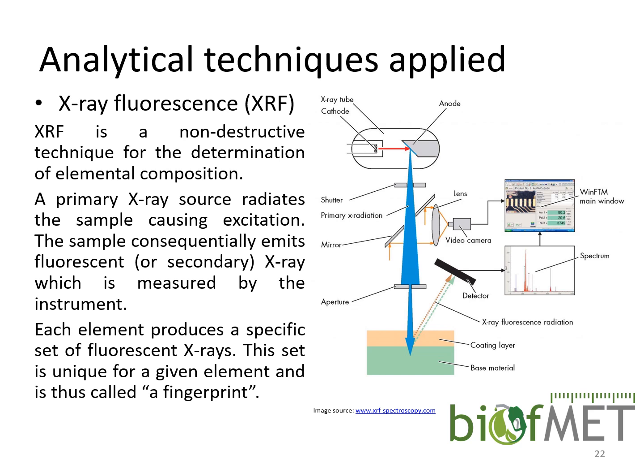These fluorescent X-rays are also very particular for a given element, so you can use their energy or their wavelength to assess the identity of the element, and by the intensity of the signal you can also assess the concentration.